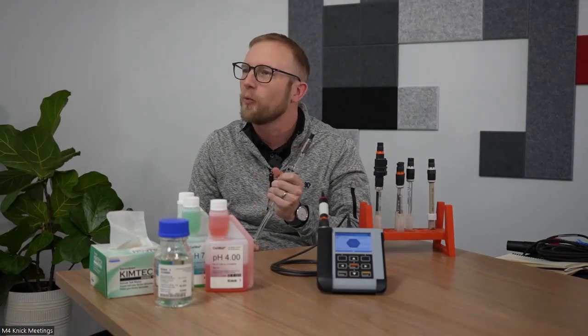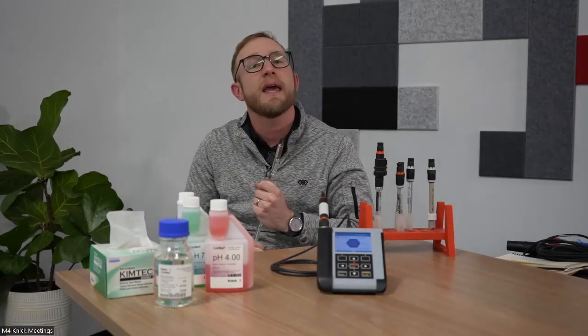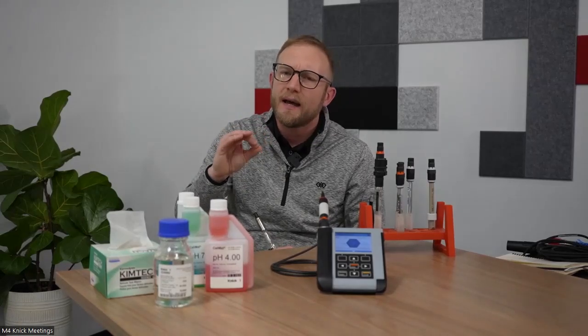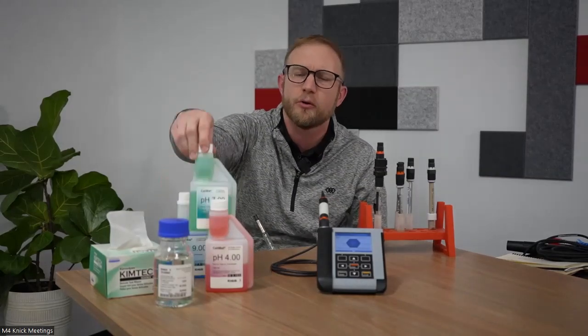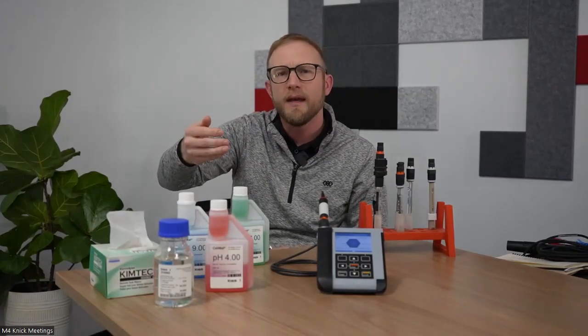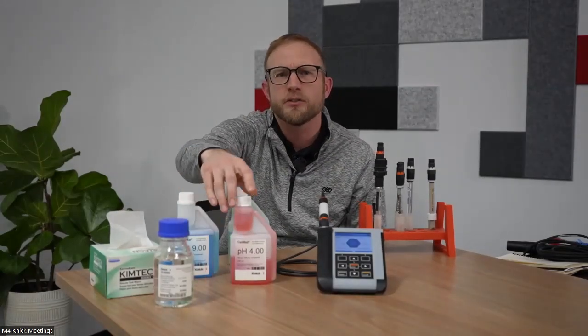We had a couple more questions just come in. I'll answer one last one here, and then we're going to conclude the webinar. The question that came in is specific around calibrating in order of the buffers that is utilized. It often doesn't matter the order that you utilize, but I highly recommend best practice to start with a neutral buffer 7. Set your 0 point and then rinse in between and move on to your next buffer solution.